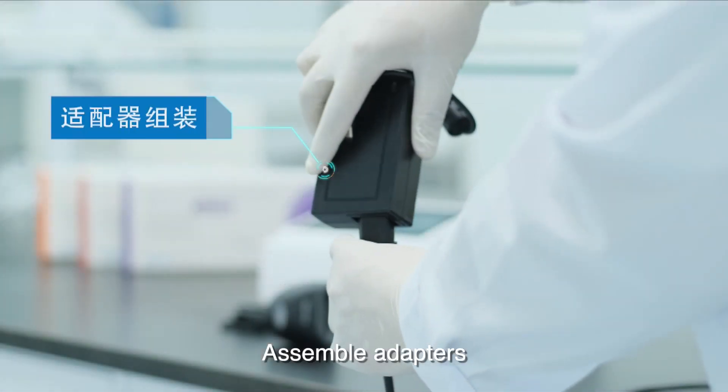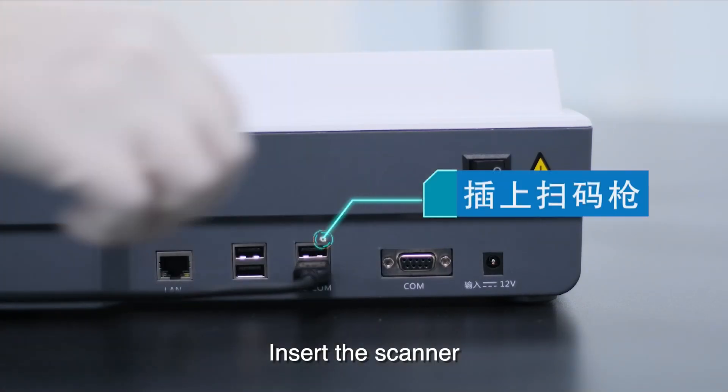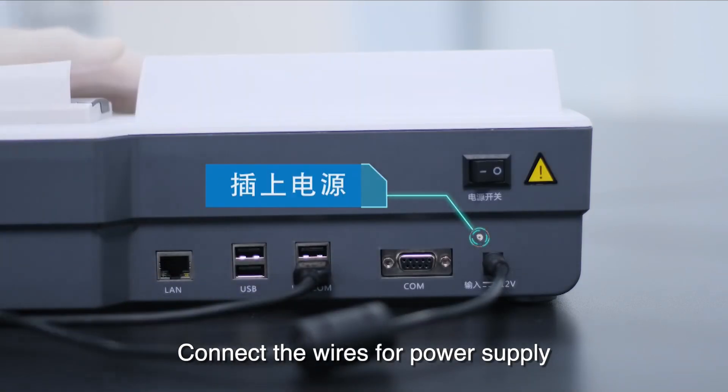To set up the instrument, assemble the adapter, insert the scanner, and connect the wires for power supply.